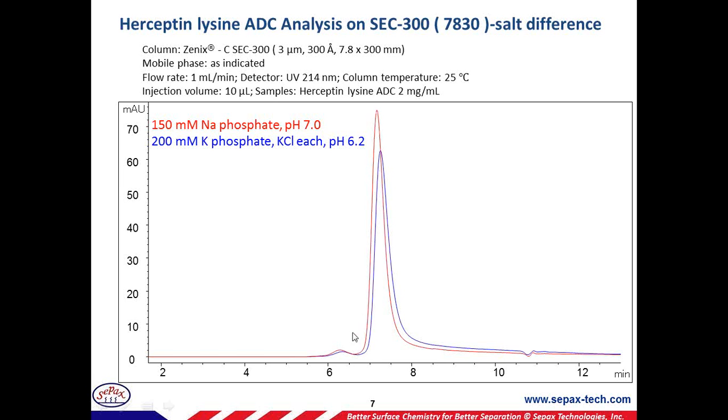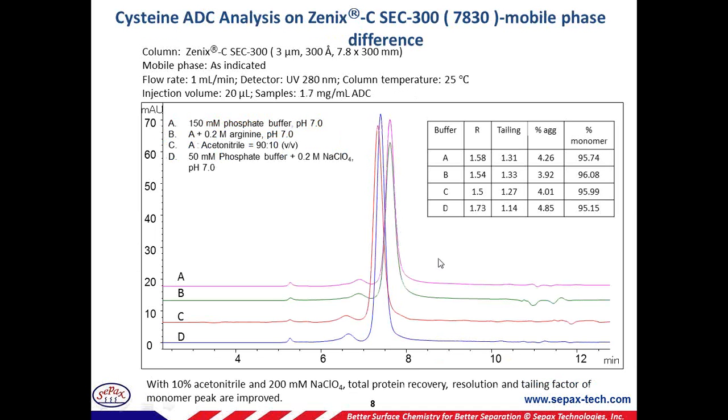that gives you better recovery and a much sharper peak. So I would say, with individual samples, you probably should try a different salt concentration and different salt additives as well. So next we'll be talking about a few of the mobile phase additives.